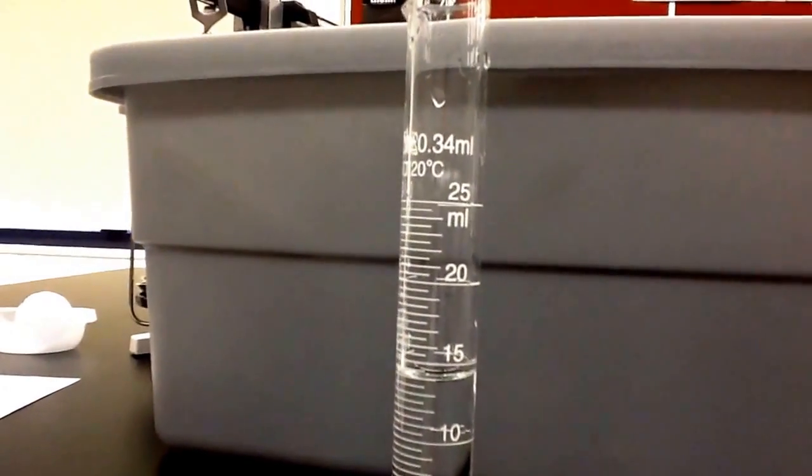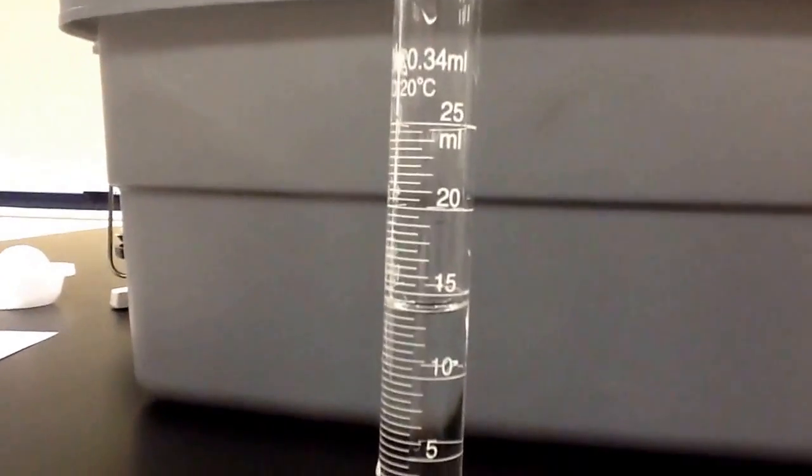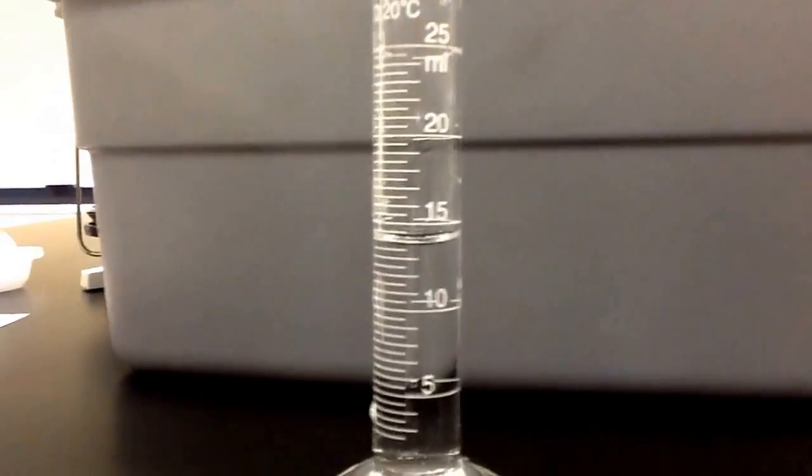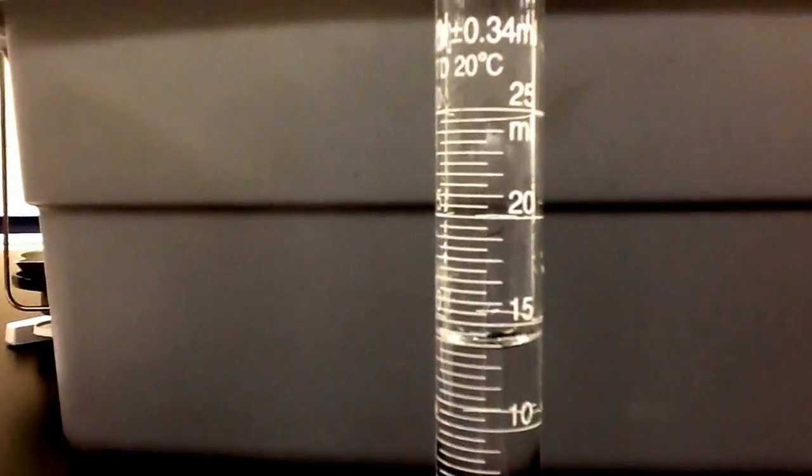I have some water in this graduated cylinder and we're going to read the volume of it. If you'll notice on this side of the graduated cylinder it starts at the top going zero down to twenty, and on this side over here it starts at the top going twenty-five down to five or zero. This is the side we're going to read when we're measuring the volume; the other side is for when you're pouring out of it. We're going to get down to eye level right here and measure this.